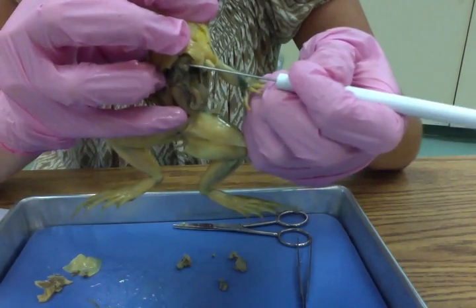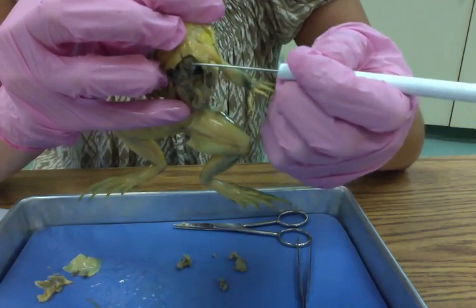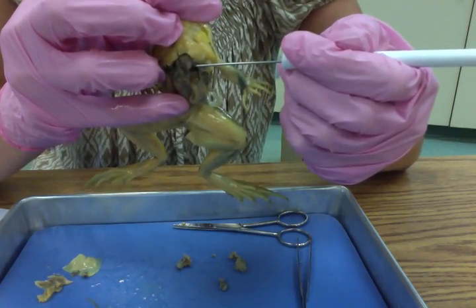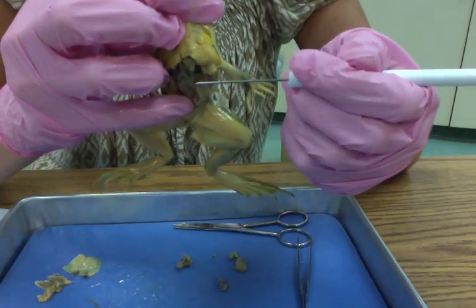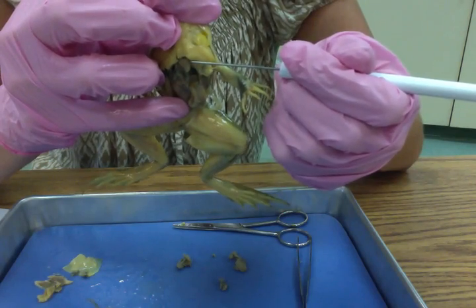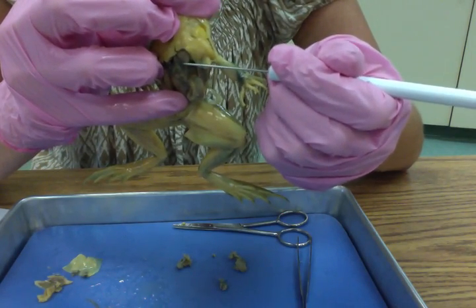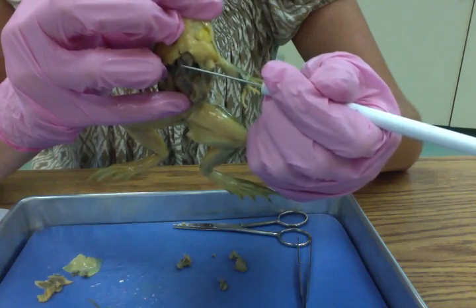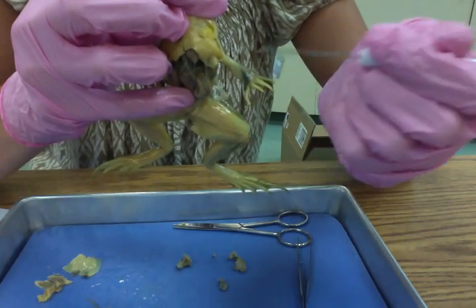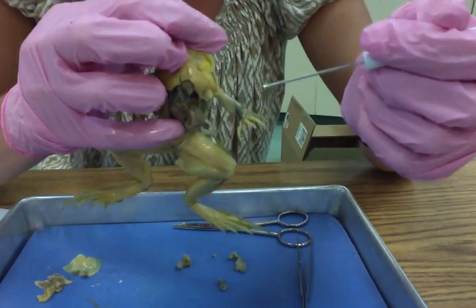And so remember, frogs and amphibians in general have a 3-chambered heart. We can't clearly see the 3 chambers, but we have 2 atria that receive blood. Then they pump the blood to the ventricle, which sends the blood either to the lungs to get oxygen or out to the body once it has oxygen.